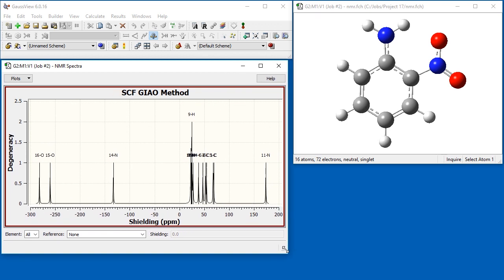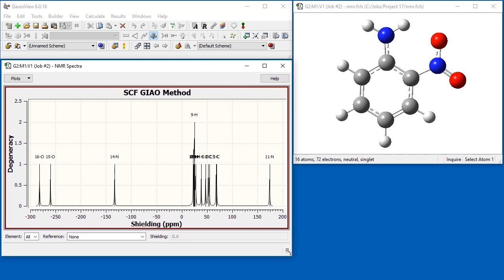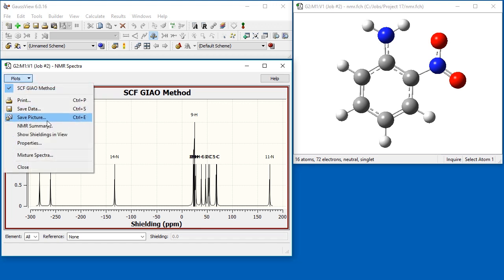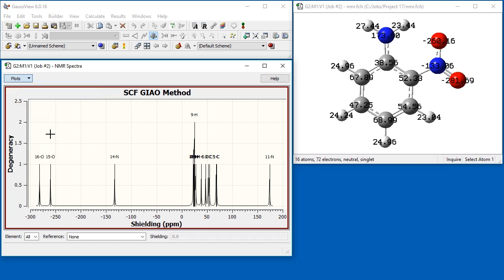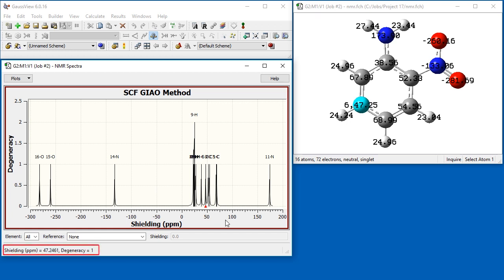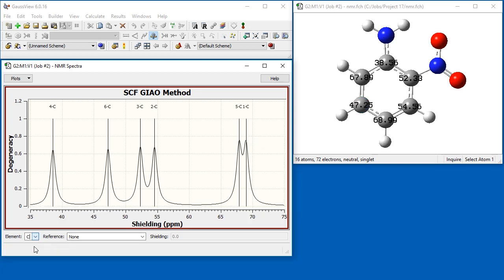By default, the graph plots the predicted shielding values for all the atoms in the molecule. You can also label each atom in the view window with its shielding value by selecting Show Shieldings in View from the Plots menu. Clicking on either a peak in the plot or an atom in the molecule displays the numeric shielding value in the bottom part of the spectrum window.